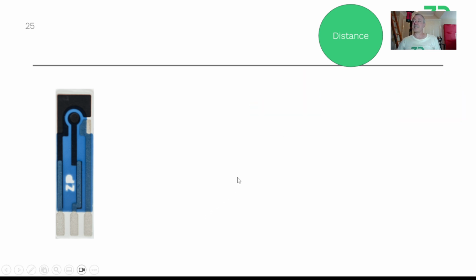So the next bit is area. If you've got a large working electrode, then you will pass a larger current. If you halve the working electrode, you often halve the current. So making a smaller working electrode is, from a compliance voltage perspective, quite good. But what you do find is that people have quite large working electrodes.